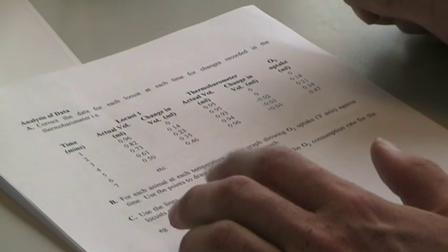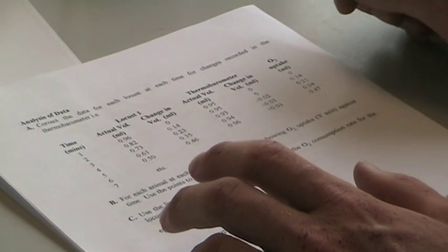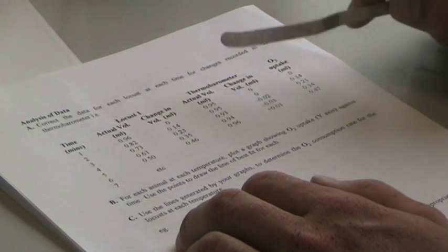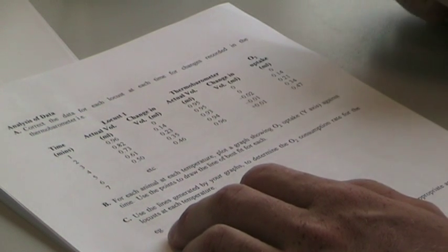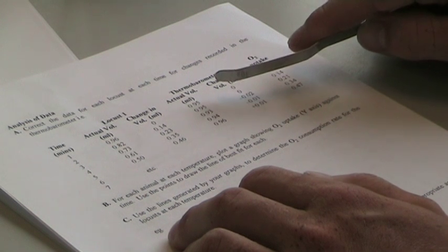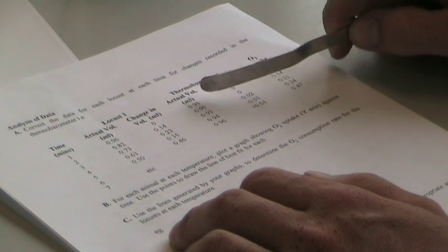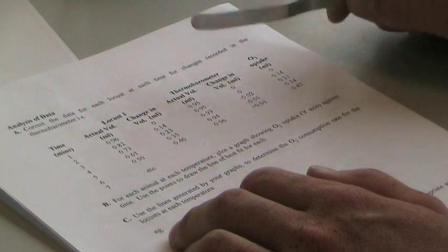To take account of the oscillating temperature and the effect that has on gas volume, you would use the thermobarometer data. You plot the actual volume of where the meniscus is in the manometer here, and then that gives you the volume and how it changes.